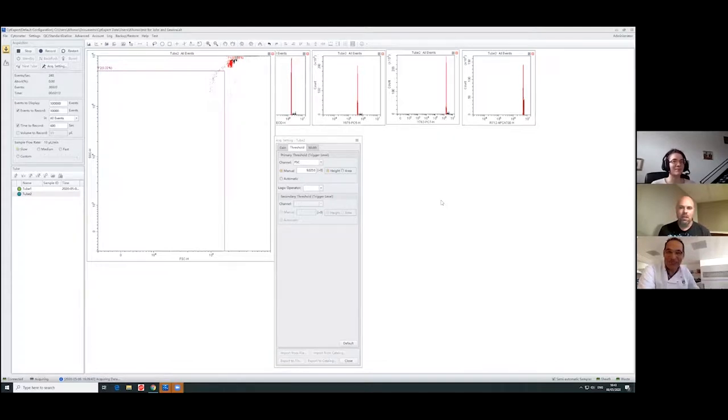Yep. That gives you the most, you have to remember you're trying to get data on a linear plane. I was joking that they throw out the stuff they can't figure out. Well, it's outliers to the linearity of the instrument. If you start going too fast, I think the Cytoflex doesn't mind anything at 10,000 events or lower. Once you get above that, the linearity goes sideways, and it's easier to abort these problems. So keep the events per second down, everything below 5%, and you can test that for yourself, or just read some papers that have done it.